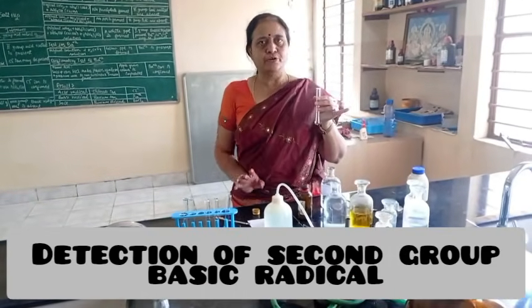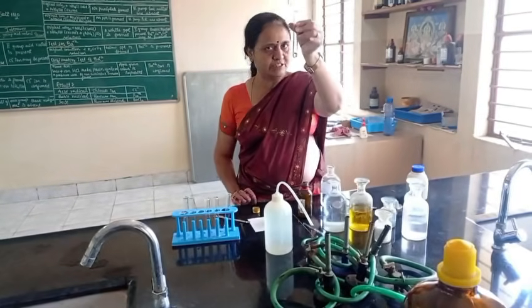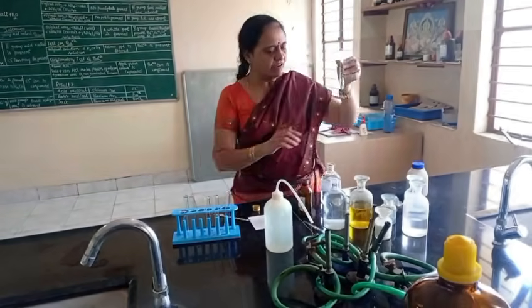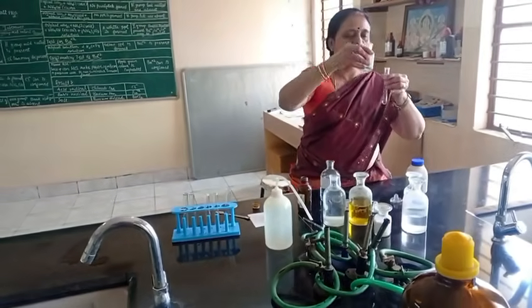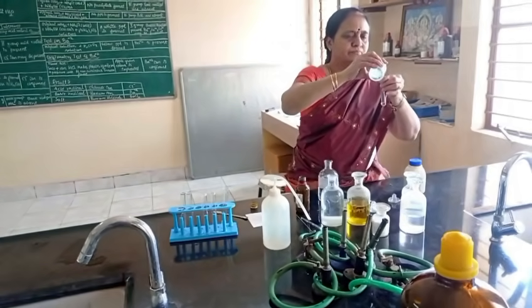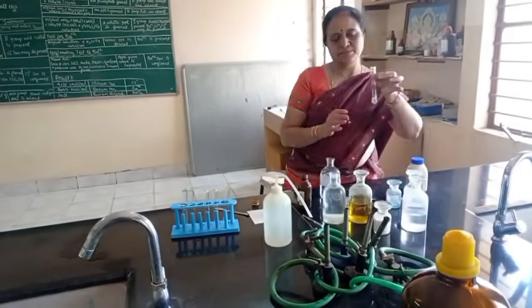Next, I move to second group basic radical. For second group basic radical, I am taking original solution, dilute HCl. For this I am adding H2S. No precipitate. Second group basic radical absent.